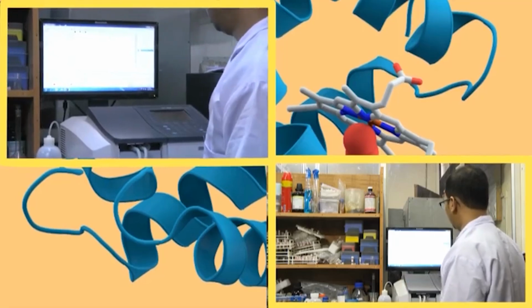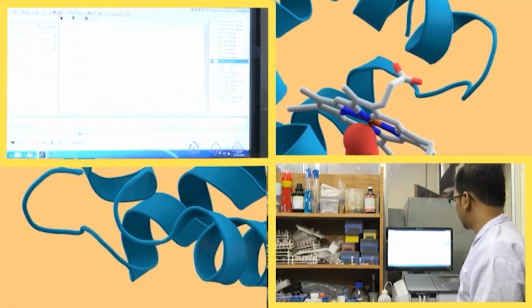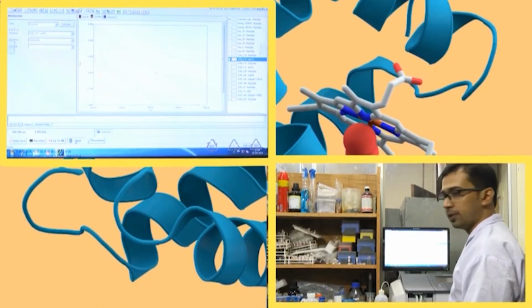And then doing auto zero. After that, start.